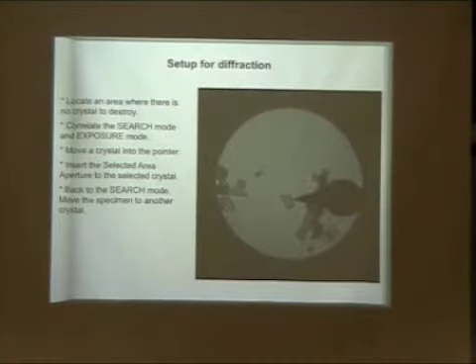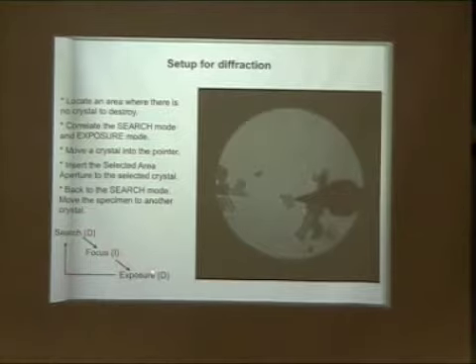Actually, I'm recording. So then you basically cycle through this mode, search, focus, and exposure, going back and forth, just like you're recording your normal image, right? You may ask, because we only mentioned two modes, search and exposure, why you need to do the focus. You can sometimes skip this focusing, but focus is also important.